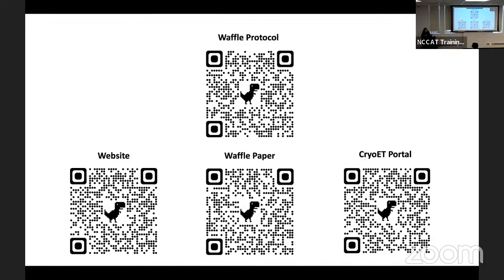But most of my grids are parallel or just slightly off, which is also fine. And then you get the occasional one that is completely turned, and you're like, whatever, there's nothing to do about it. If you're a super stickler, you could unclip it and reclip it, but I think it's not worth it. And yes, you can unclip and reclip grids.